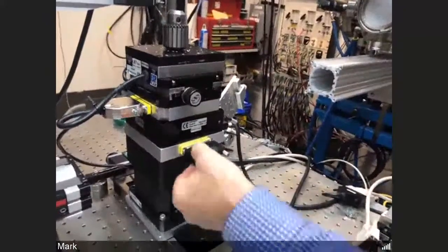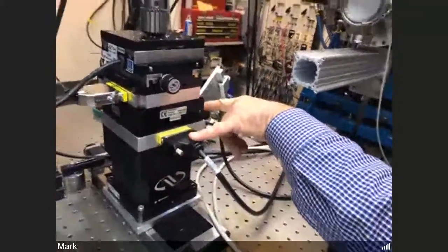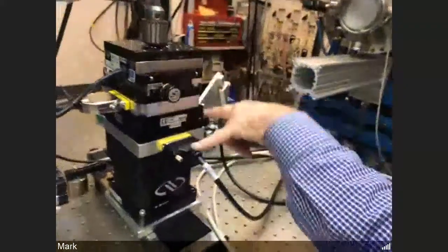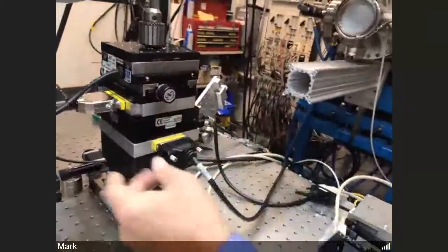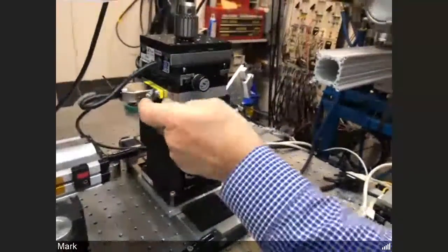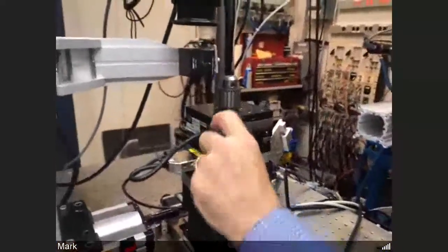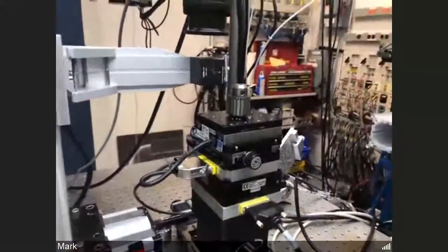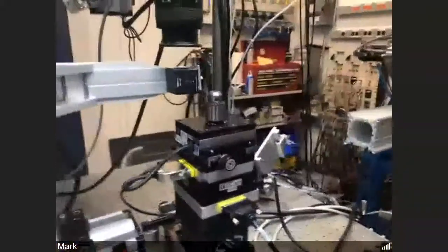So the motor signals for those translation stages go through a slip ring system here through the rotation stage. So slip ring, rotation stage, slip ring, and then the two translation stages that are on top of the rotation axis that are used to center the sample on the rotation axis. Then maybe Tim can swing around.